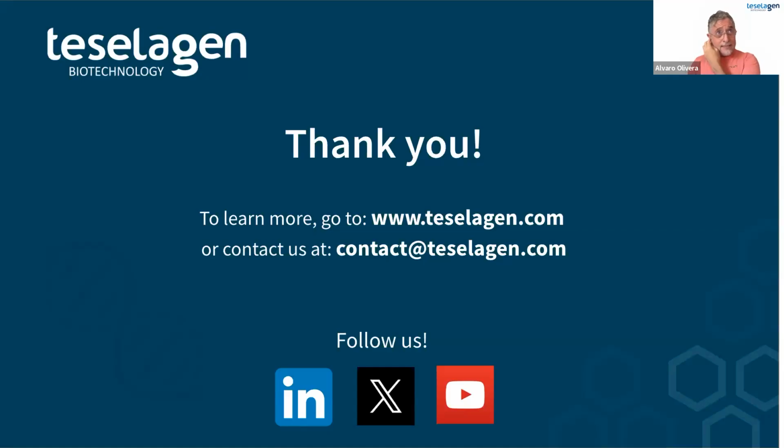For Gibson assembly, this tool is a simple tool to design primers for a single PCR you want to perform in your lab. So you design the primers for that exclusively. If you want to design primers that are going to be used to amplify parts for a Gibson assembly, then you have to use our special tool for that.